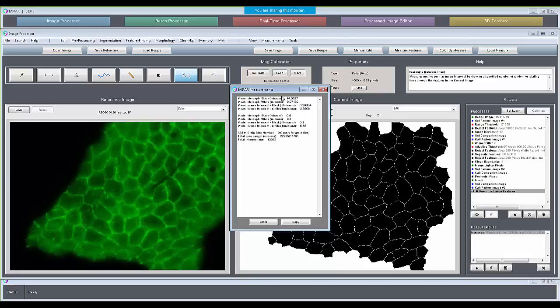This variation is giving you an indication of the precision of the ruler that you're using for this one measurement. You could up the number of lines and then you'd have a more precise ruler. But if you were observing multiple cases of these cells from image to image, you're going to expect more of a variation from image to image than the sensitivity of the ruler that you're using. So it's sort of a precision versus accuracy argument.